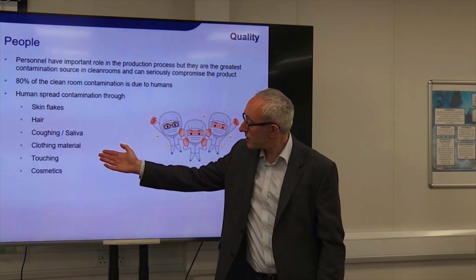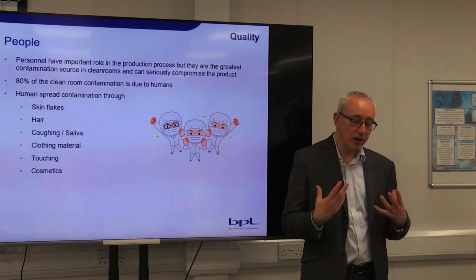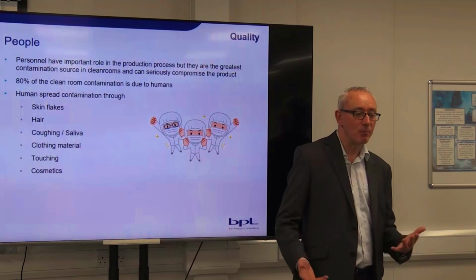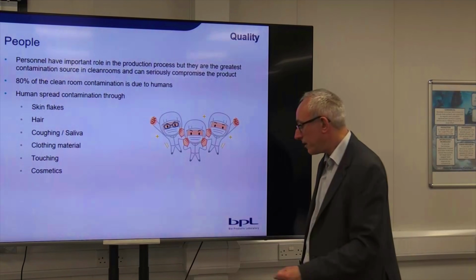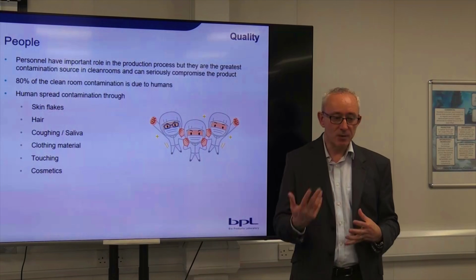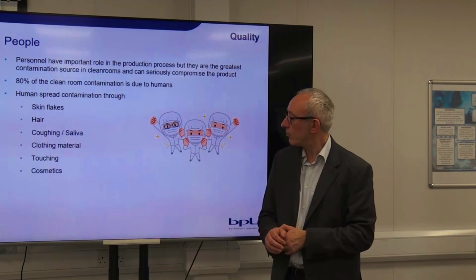And then the other activity is by touching. And touching is an easy one to get into the habit of spreading contamination. So if I've disinfected this surface here, but kind of absent-mindedly put my hand on the table there where there is contamination, and then go back and touch this surface, then that transmission route is quite a key one. So the kind of disciplines of spraying hands regularly or using tools to pick things up is an important one.